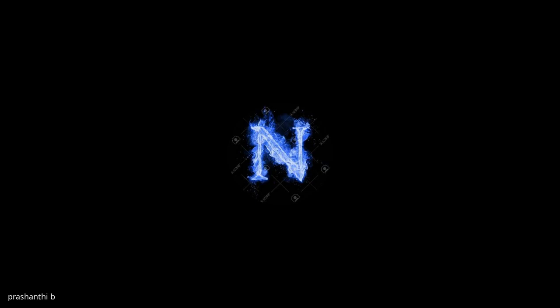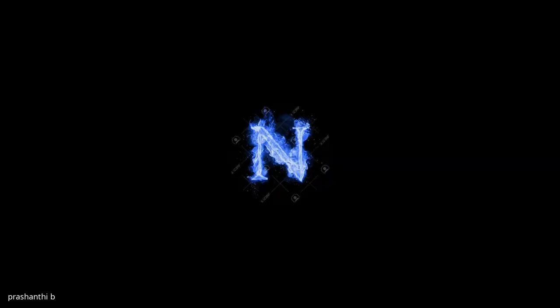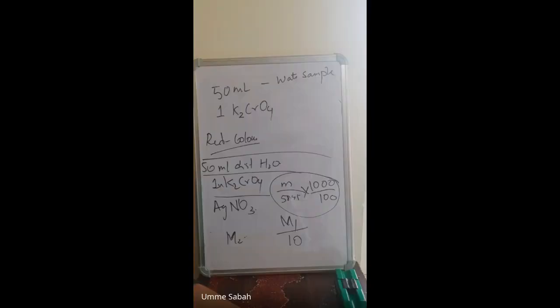Ma'am, what is V3, ma'am? V3: how much silver nitrate have you used for the water sample? You do 3 trials, no? And then you will get concordant values. Take that value there. Same way for V4 also. How much silver nitrate did you use for the blank? 3 trials you did. Take the concordant value. This is with the distilled water, right? Distilled water. That is V4.